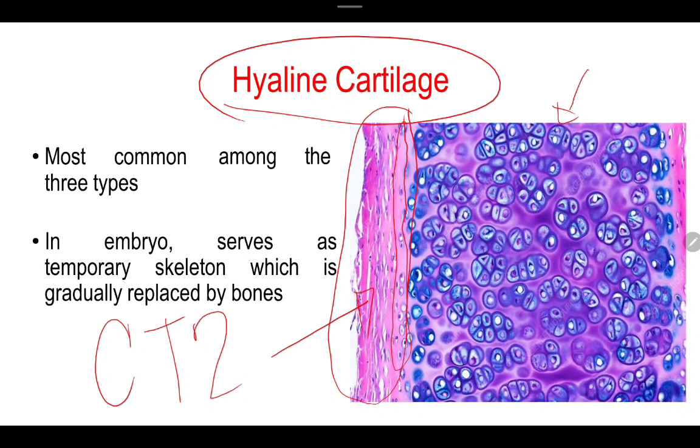Okay? So, the reason being, bakit dapat collagen type 2 siya, diba? They are not that strong. Tama? So, it means, gaya na nabanggit kanina, ang hyaline cartilage is the template for bone formation. So, ibig sabihin, mas madali maka-infiltrate dito ang mga blood vessels. So, mabilis sila maka-make ng resident here to give rise to a new bone kasi nga, collagen type 2 ang meron.